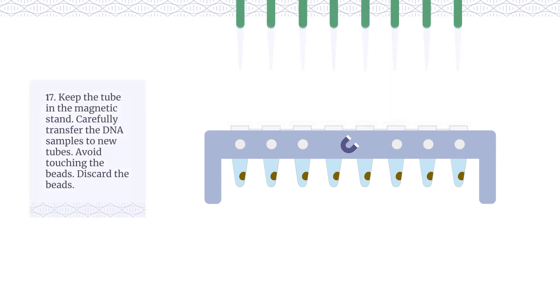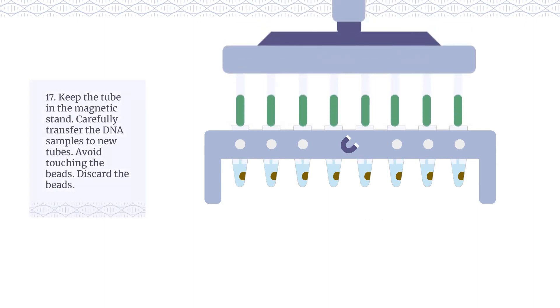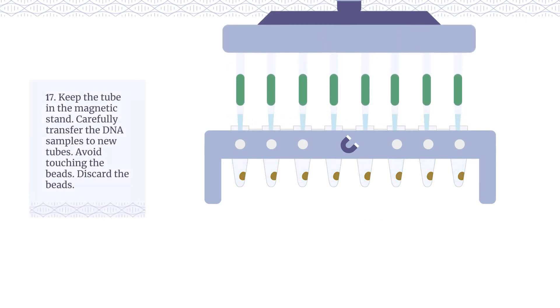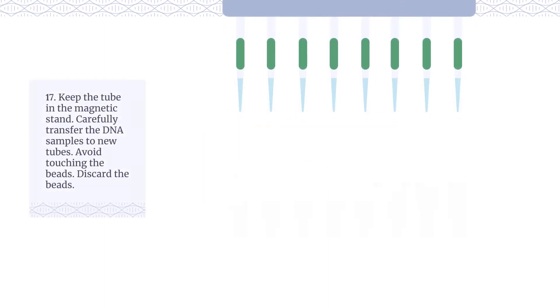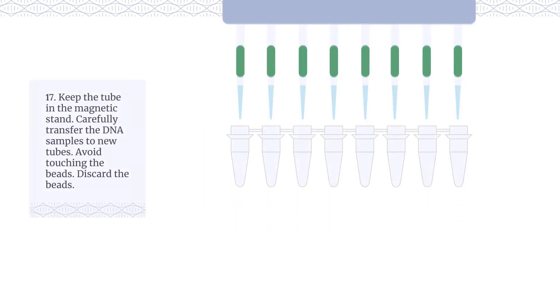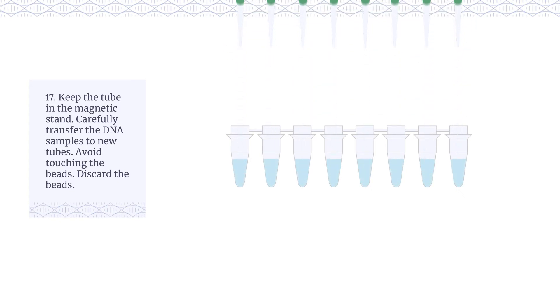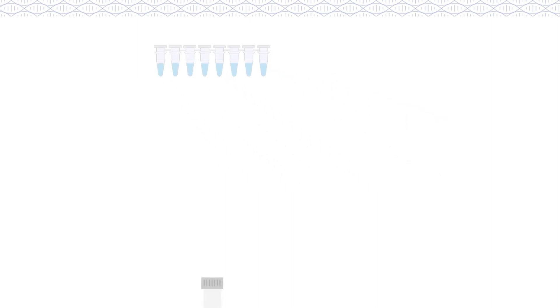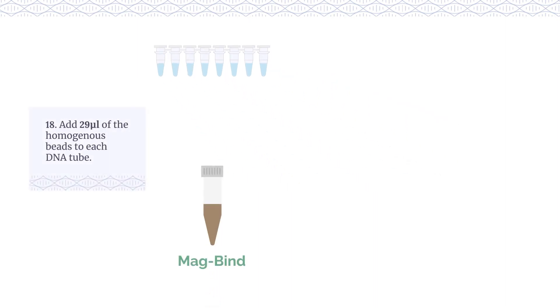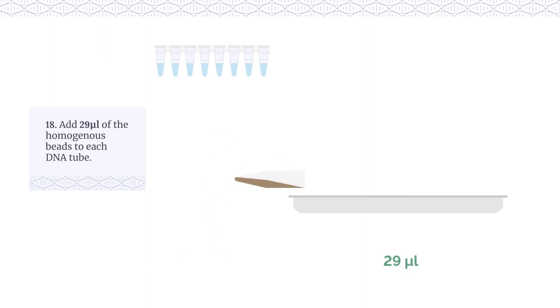Keep the tubes in the magnetic stand. Carefully transfer the DNA samples to new tubes. Avoid touching the beads. Discard the beads. Add 29 µL of the homogenous beads to each DNA tube.